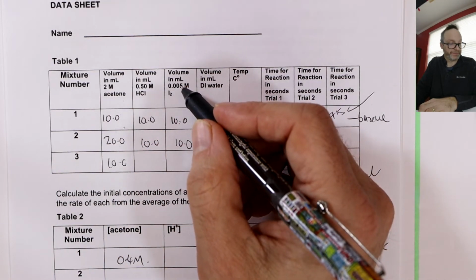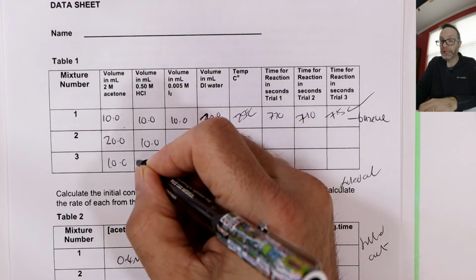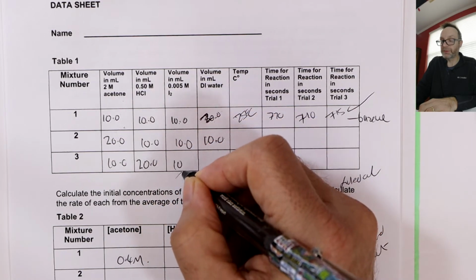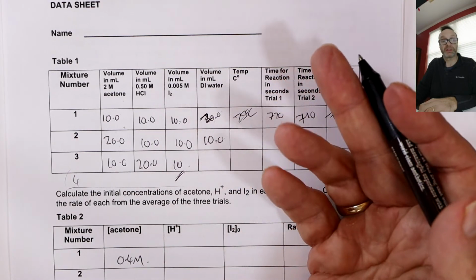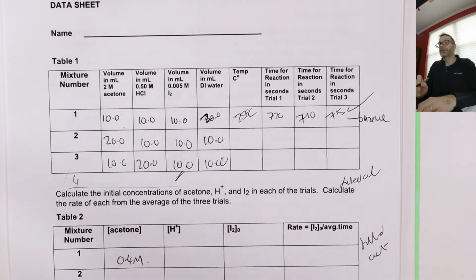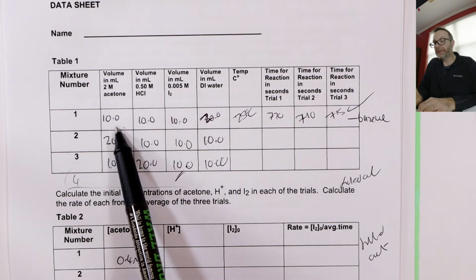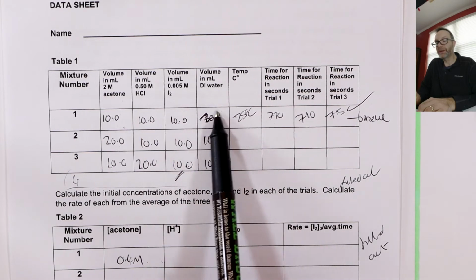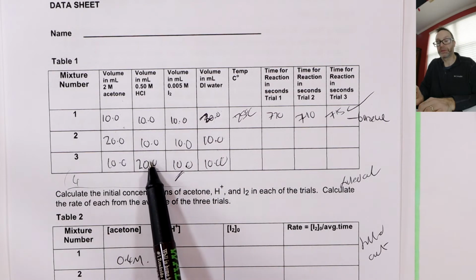Remember we change this one. 10. Remember this one is kept constant because we could do a 4th trial and test iodine, but we've already told you it's 0. Okay. And that's 10. Okay, so there are our raw data sets, yeah? Every time we're comparing to baseline, and then we systematically double the reactants we're interested in, yeah?